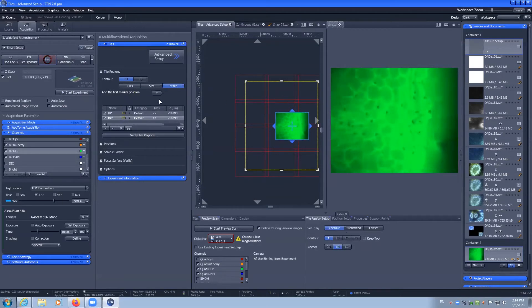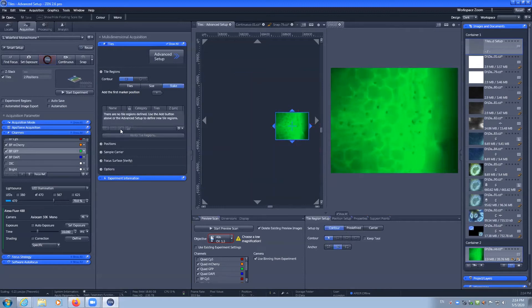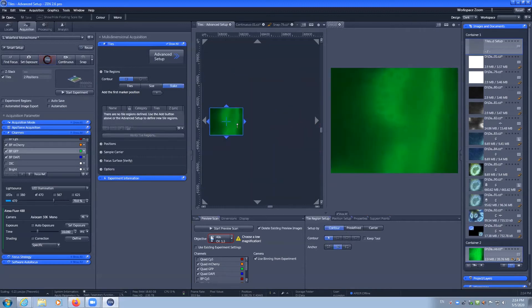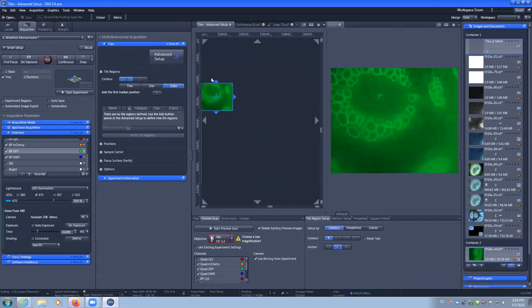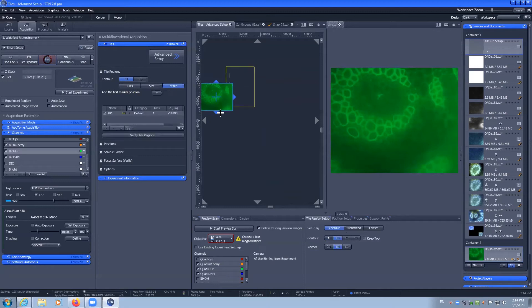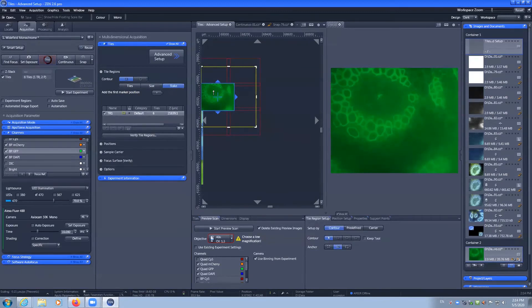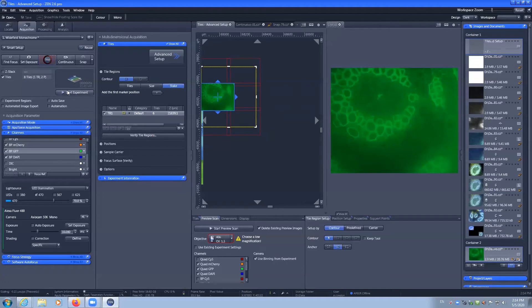So I'm going to delete these two positions. I'm going to come back over here where we had an area of interest and I'm going to draw a tile region to capture. Now to capture this, there are these six tiles. I'm going to now click start experiment.